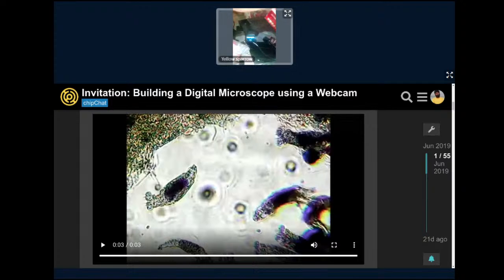And secondly, towards the end, we can have 5 to 10 minutes dedicated to seeing other ways in which a smartphone can be made into a magnifying device. It won't be as powerful as the one we are making with USB, but it will also give a decent picture. We will keep that towards the end of the session.